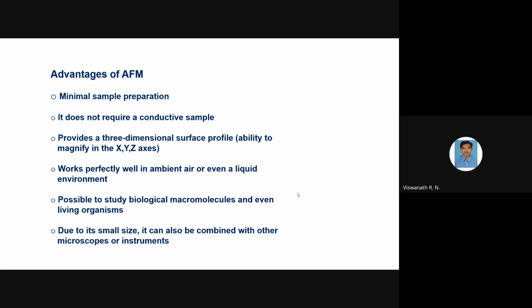If there is a missing atom, a cavity, then the tip knows there is something missing, because the scanning force is fixed. If you want the deeper ones, I have to give more, positive force. How much positive force I am giving corresponds to the height of the structure.